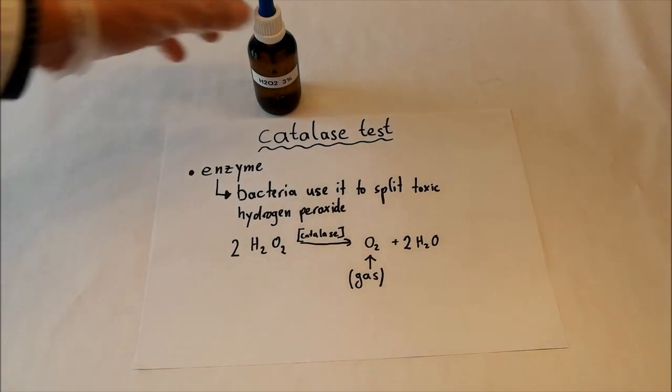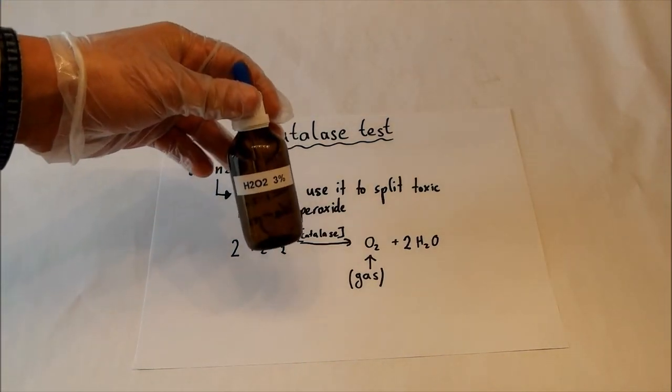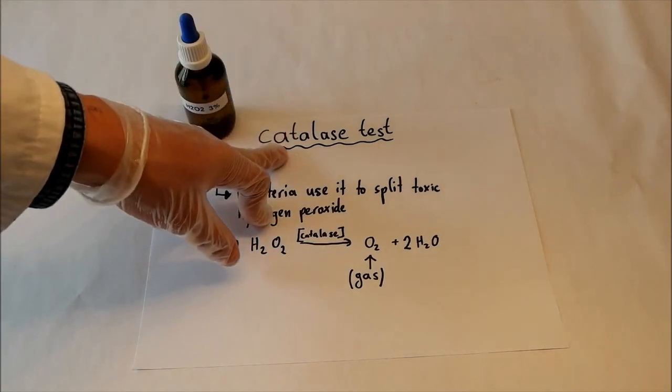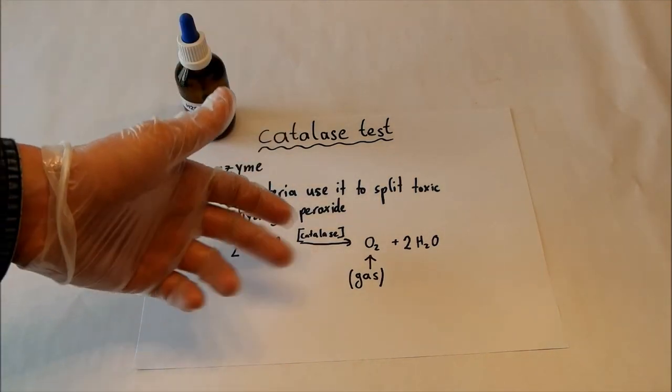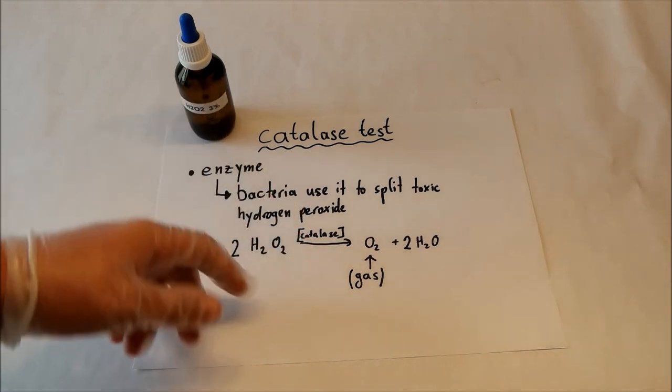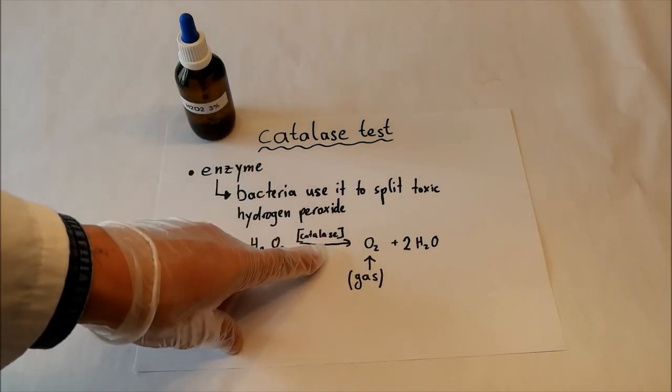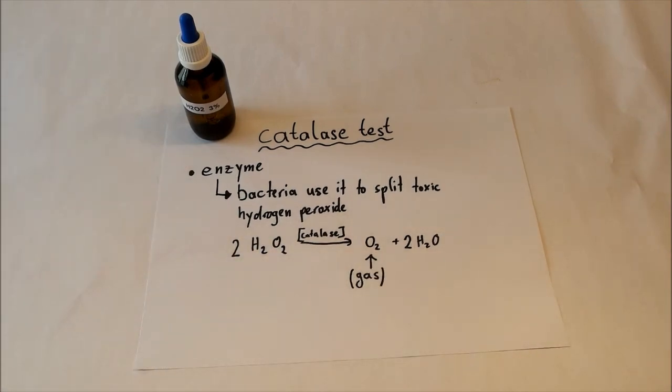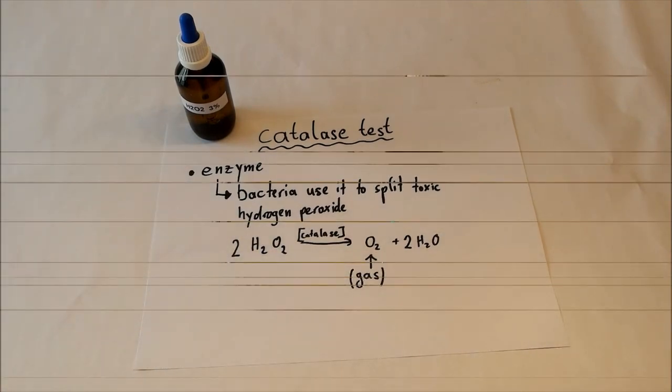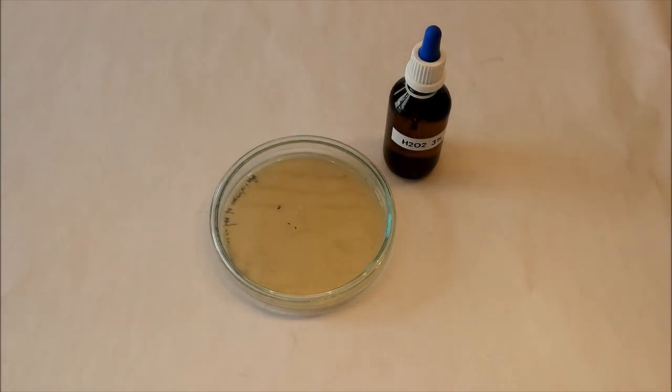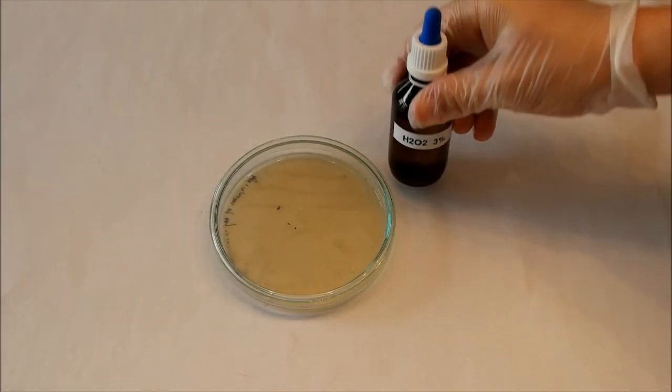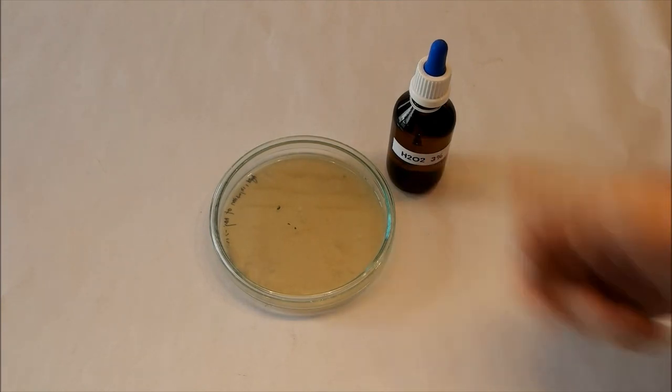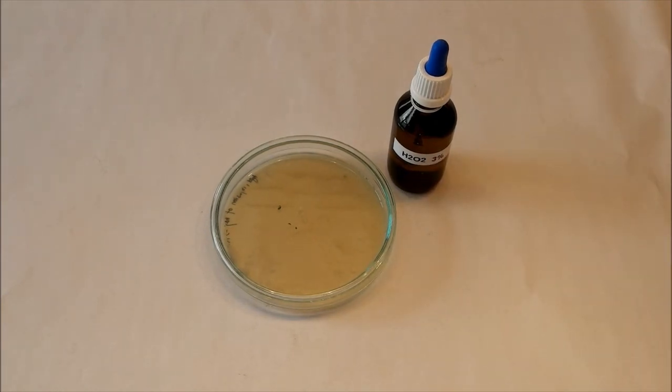And when we now drop our hydrogen peroxide on a bacteria colony, and it's catalase positive, you will see bubbles get out of this colony, because the catalase, if the bacteria produces it, splits the hydrogen peroxide. So now I'll drop a bit of this hydrogen peroxide on a colony to see whether it's catalase positive or negative.